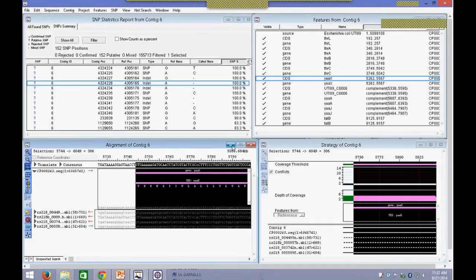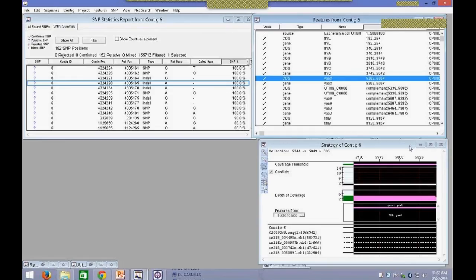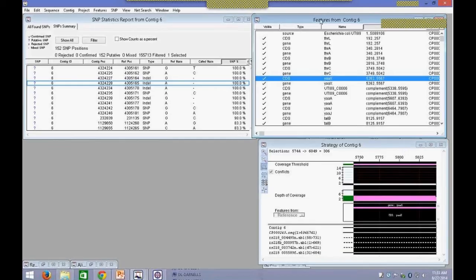Those are all the main views I wanted to show you in the reference-guided alignment. I will now go ahead and close out of this project and proceed to a de novo assembly. Before we go ahead, there's one question: what kind of hardware setup is needed to run these reference-guided Sanger assemblies? SeqMan Pro is a very robust program — it requires basic configuration. Any Windows 7 32-bit computer will do; up to 4 gigs of RAM is sufficient. Any modern dual-core processor would be able to run your assembly, and if you have older hardware, that should also work just fine.